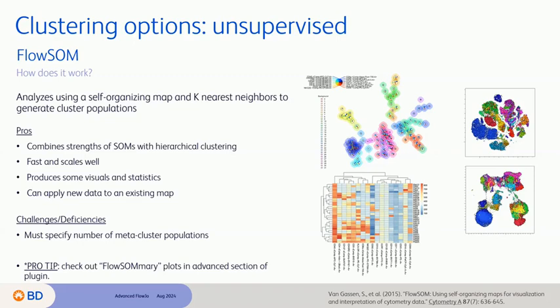Someone's asking, running Phenograph always failed for them. The possible reasons and what's a possible solution. Possible reasons. First, I would just check making sure the R packages are installed. So in the PDF that comes with the download, it lists packages, so you can take that command, put it in R, make sure those are installed.